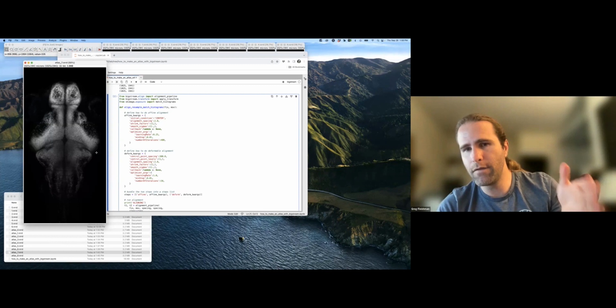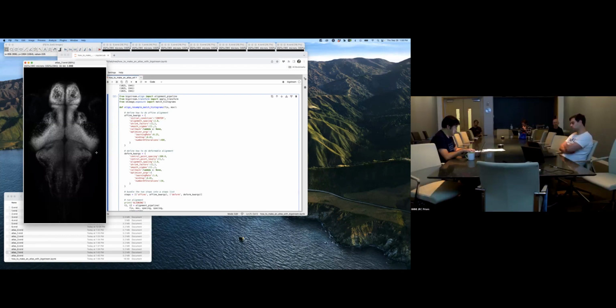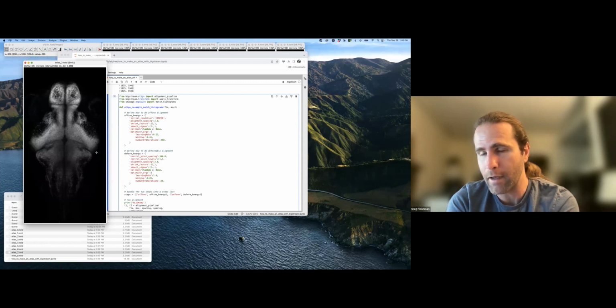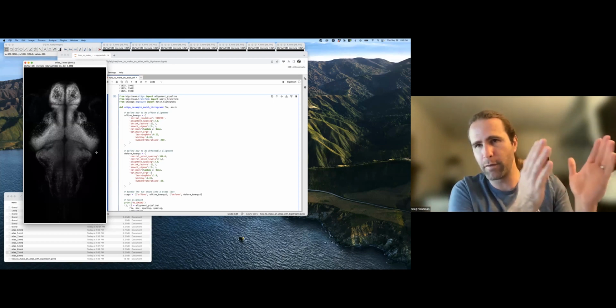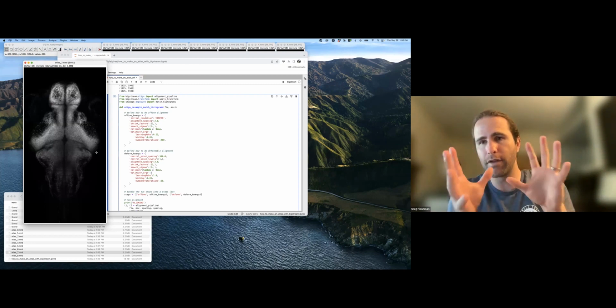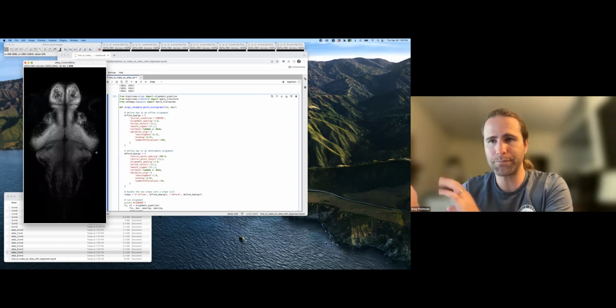For each individual experiment, you're collecting sequential images of the ball, right? A video, yes. Yeah, I think that a better choice for that would be motion correction or optical tracking, which is related to this in the sense that you have a bunch of different images and you want them all to be co-registered. But the way you would do that one is probably register the first frame to the second frame to the third to the fourth, and so on, so that you're accounting for the delta in the ball at each time frame change.